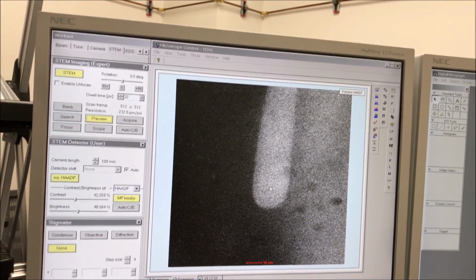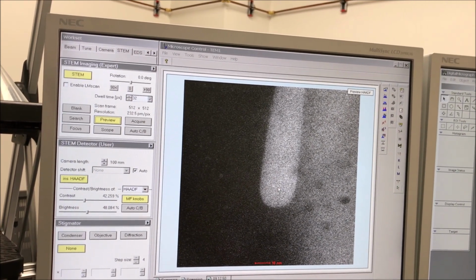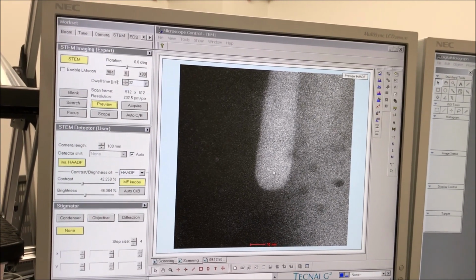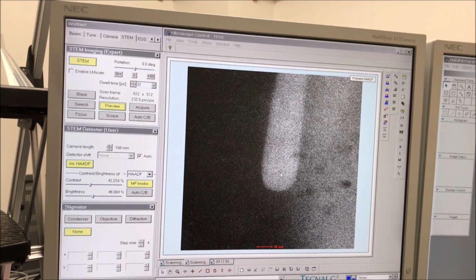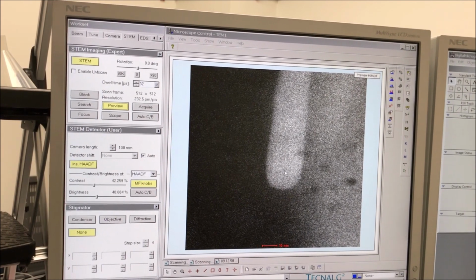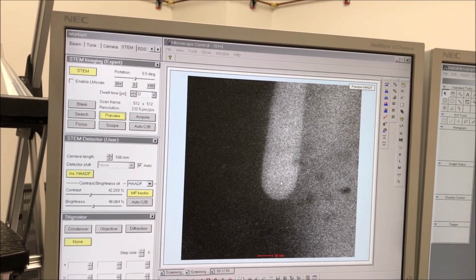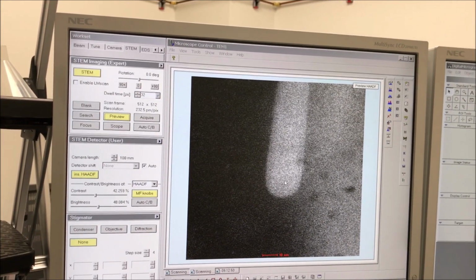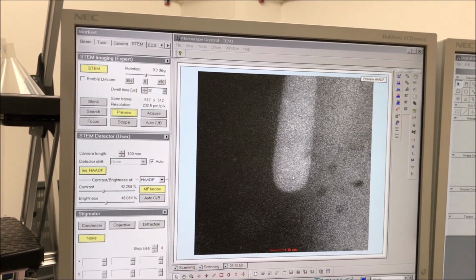What that's doing is it's adding to the total thickness of the sample. Of course that's not good if you're trying to get good high resolution detail, because that increases your total thickness, and that's the golden rule of TEM: thinner is better. So that's what contamination is, and that's why it's bad. It obscures fine details in your image.